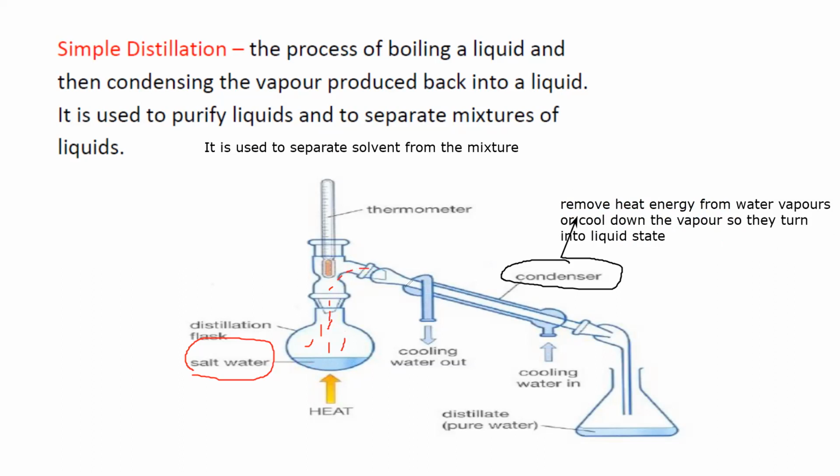When they enter this part, this is called a condenser. Inside the condenser, there is water flowing. What is the advantage of this water? This water will absorb the heat energy from the water vapors. Water will enter from here and escape from this side.